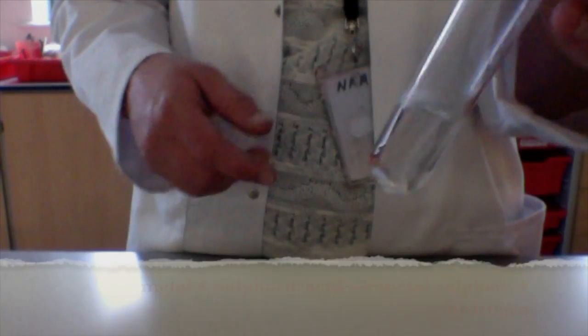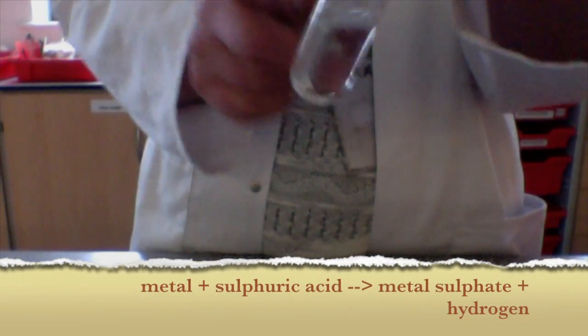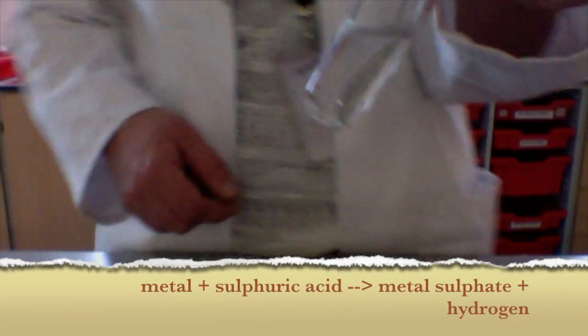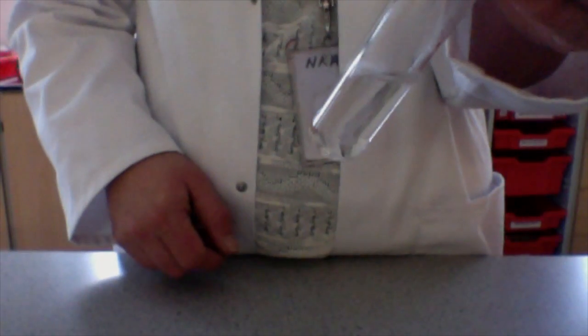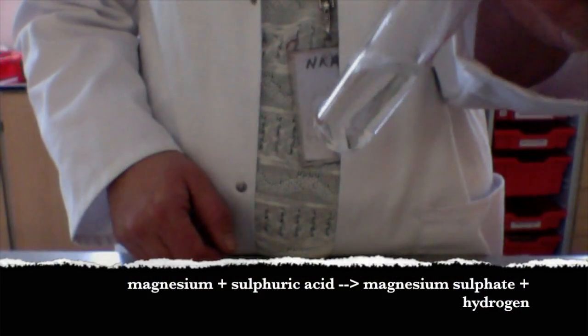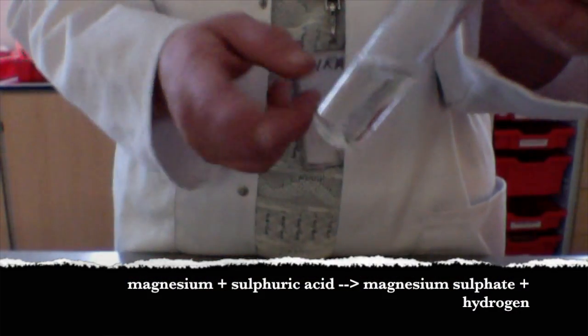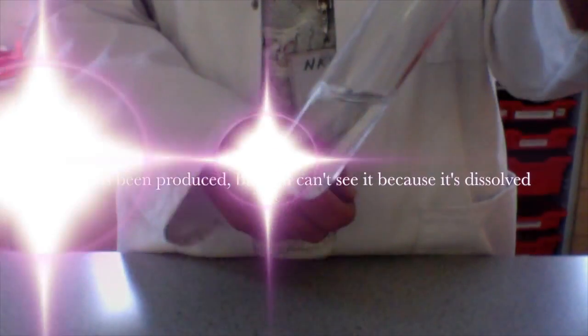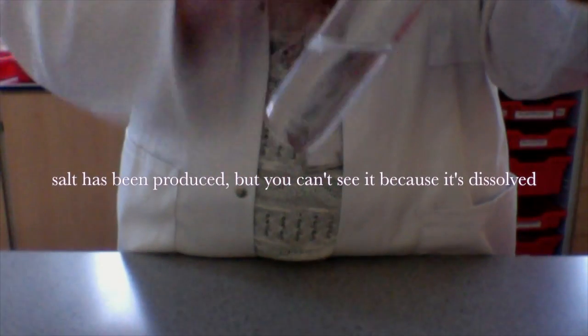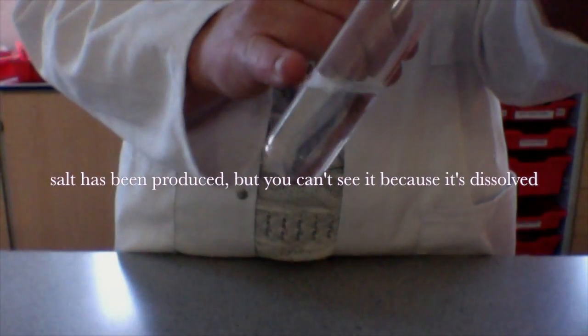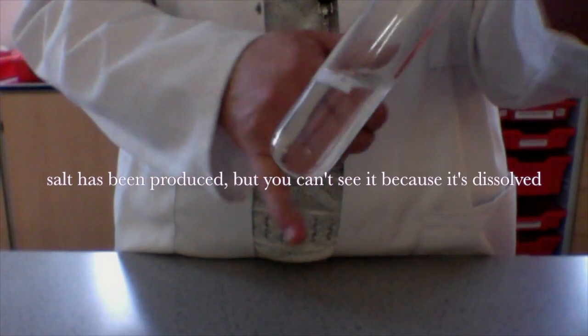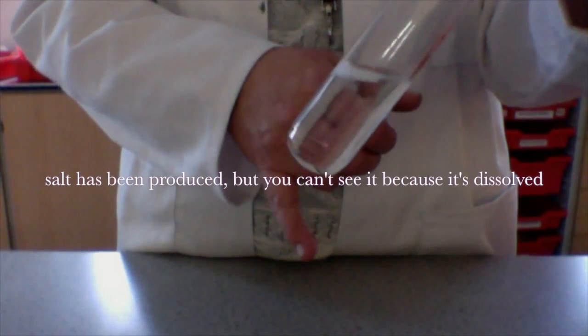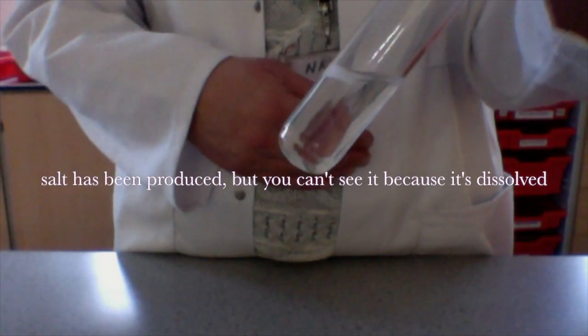Because what we're forming here, when the metal reacts with the sulfuric acid, it forms a salt called magnesium sulfate. Now, at the moment, you just have to take my word for it because all you can see here is we started off with a colorless liquid. We've still got a colorless liquid. The magnesium is disappearing, but there's no sign there that we've got a salt.